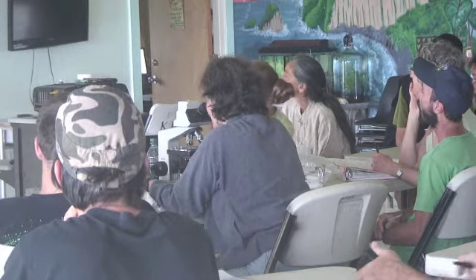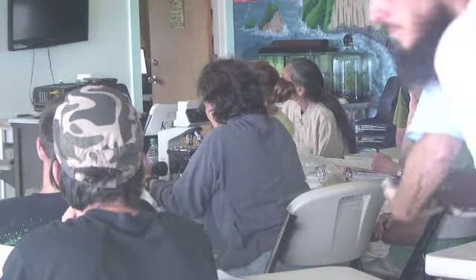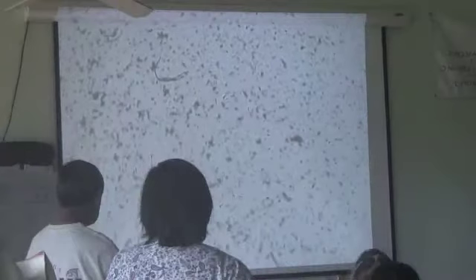because he's looking for air. And so, you know, not much time at all, these guys are going to be over the edge of the cover slip, looking for oxygen. So we got a nematode, but we're not going to be able to find them. So we're going to hope that somebody's still out in the middle here. There's the second. See the big guy right in the middle of the field moving along? Really big like that. That is most likely a ciliate.